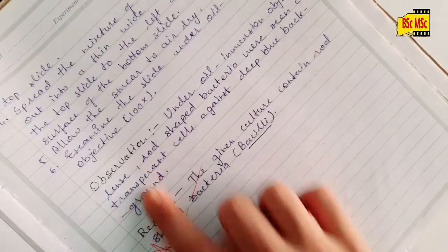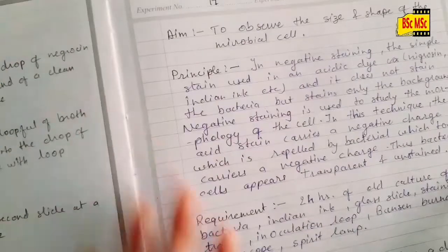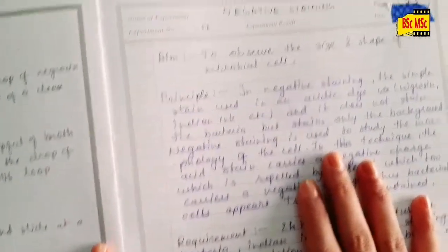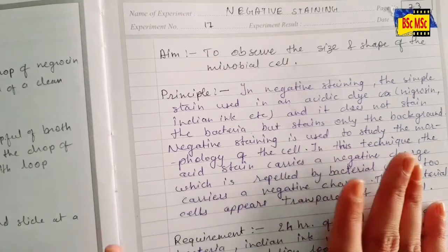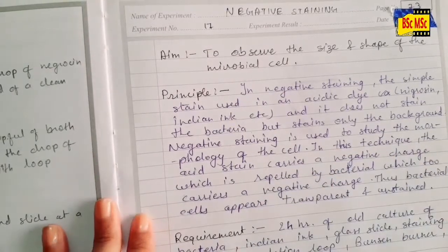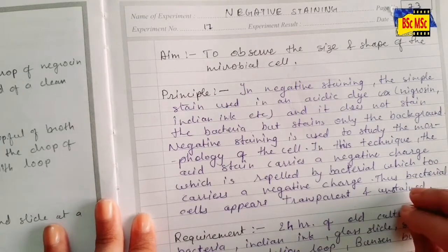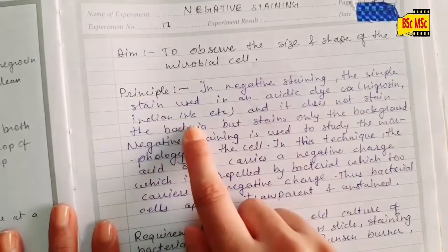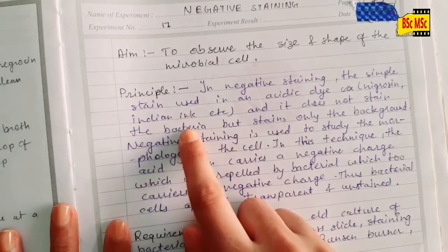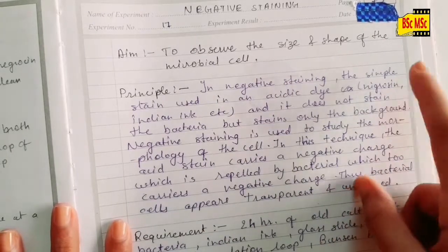Let's start. Why do we do negative staining and how? We use one dye like in simple staining, but it's different because we use an acidic dye which is negrosine or Indian ink. We choose this dye because it is negatively charged, and as we know, bacterial cells are also negatively charged.